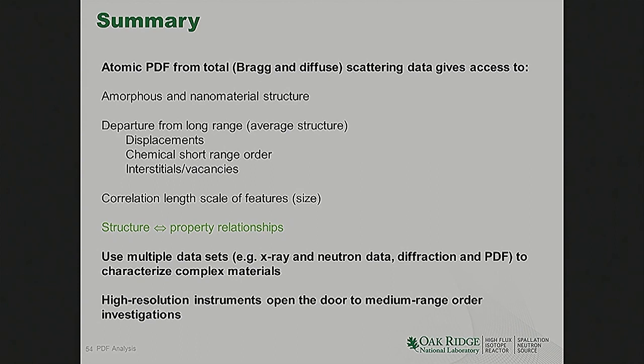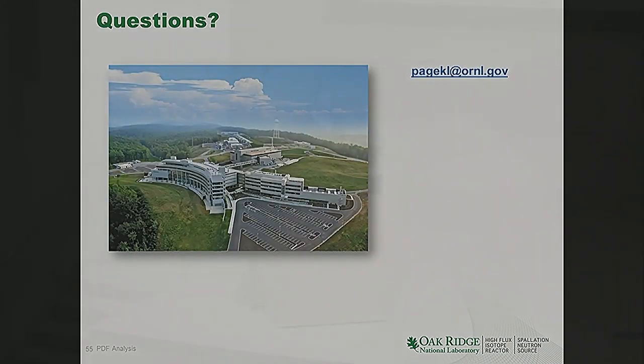So all these things are very key in determining structure-property relationships, which is why the technique is becoming mainstream. And as a reminder, the use of multiple data sets and theoretical inputs is always advisable when you're looking at complex materials. And also, high-resolution instruments can specifically tell you a lot more in this complex materials arena. So with that, I'll take any questions you might have.